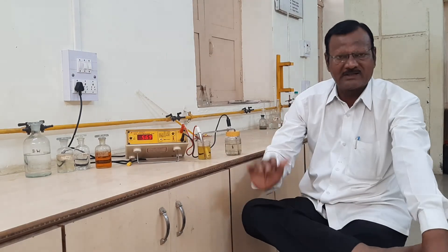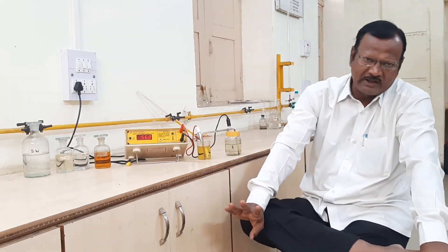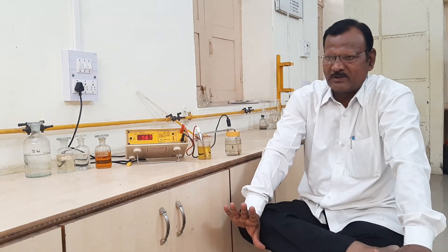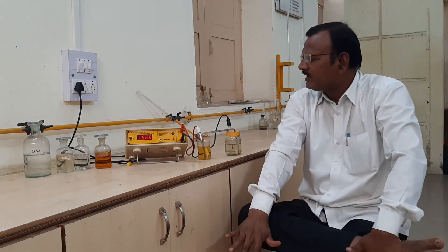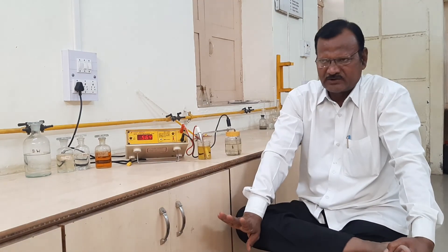For every addition of dichromate solution: from 1 to 4 ml, we add 1 ml increments; from 4 to 6 ml, we add 0.2 ml increments; and from 6 to 10 ml, we add 1 ml increments again. We record all readings and prepare the complete tabular observation table. Tomorrow we will discuss the third part: nature of graph, calculation, and results.